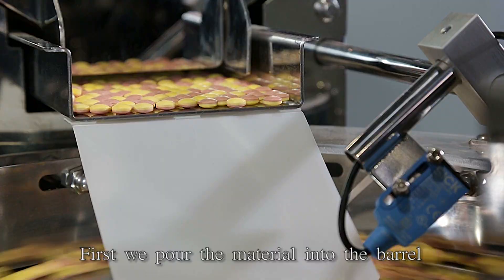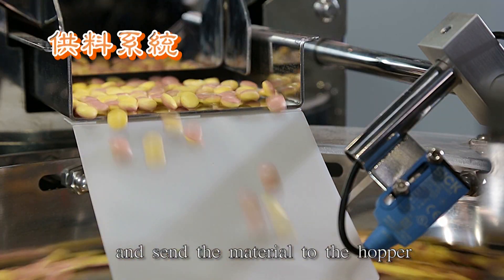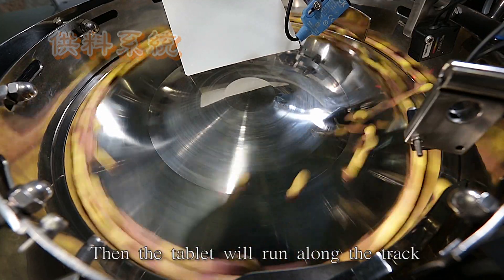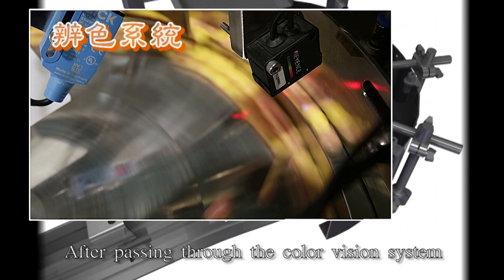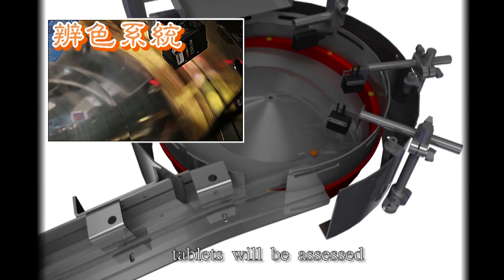First we pour the material into the barrel and send it to the hopper under the control of a sensor. Then the tablet runs along the track of a turntable by centrifugal force. After passing through the color vision system, tablets are assessed.